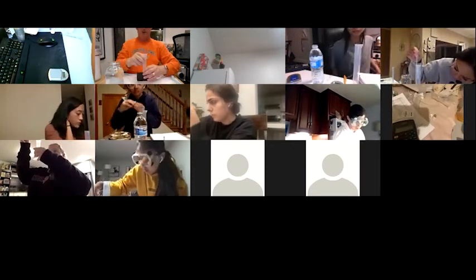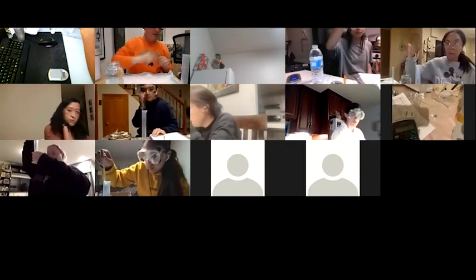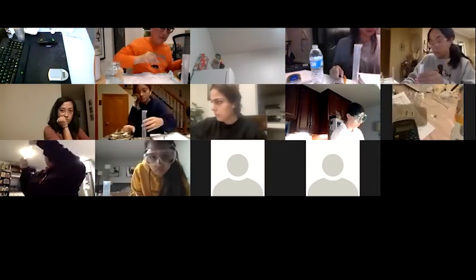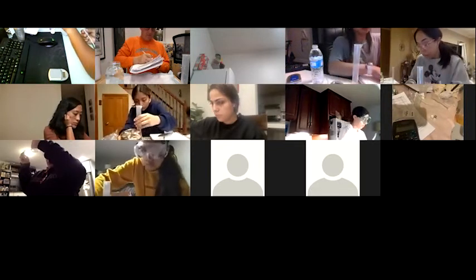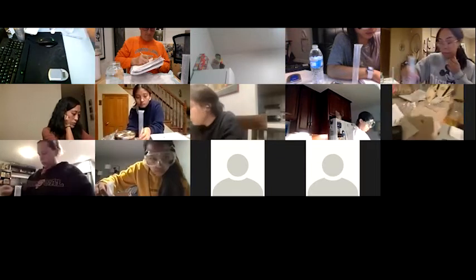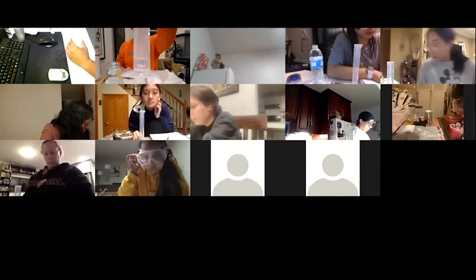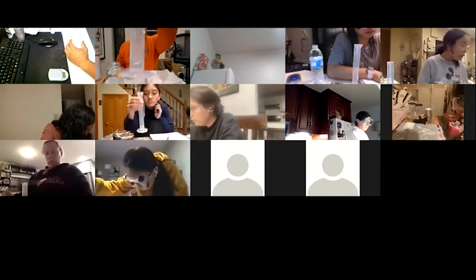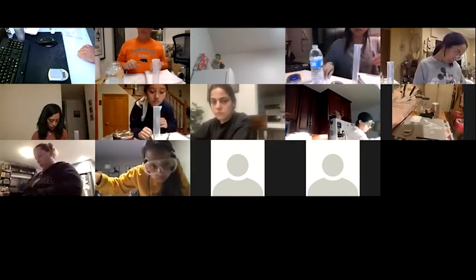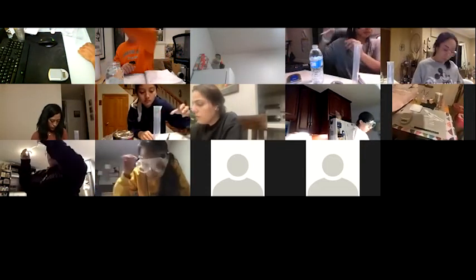All right, that's pretty close. Now I'll just measure. 34.58. So then you just keep going. You put 5 mils in here, measure the mass. Put 10 mils in here, measure the mass. 15, measure the mass. Up to 25. And then we can start making your solutions.